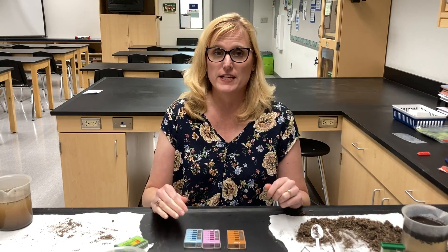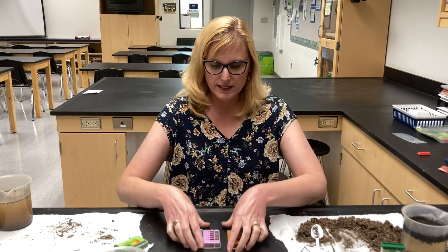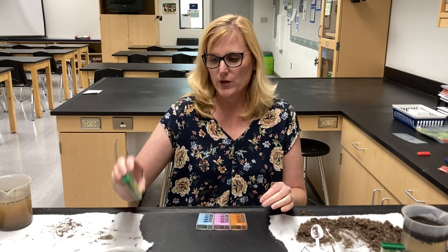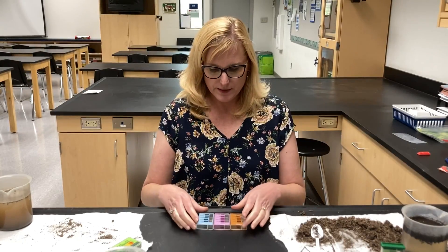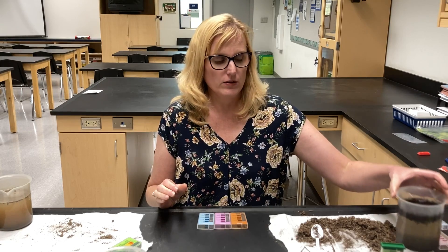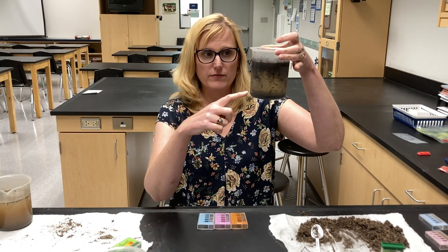It's time to do our other tests. We're going to test nitrogen, phosphorus, and potassium in these other ones. We'll take a look at the results of the pH in a little bit. But now that we've let our liquid settle, it's time to test the water above the soil.